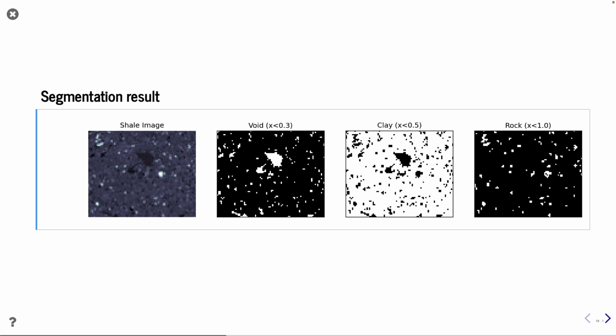And I would actually say it looks pretty good. From eyesight, I would say there are some misclassifications, but it's not too bad. The reason why it's relatively good is that the signal-to-noise ratio is pretty good in this image, so there are no misclassifications due to noise. It's more material fluctuations and the choice of where the threshold was set.